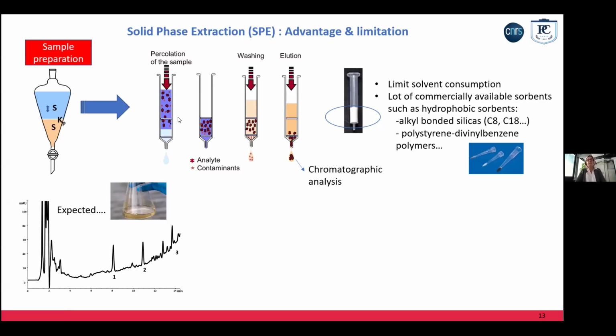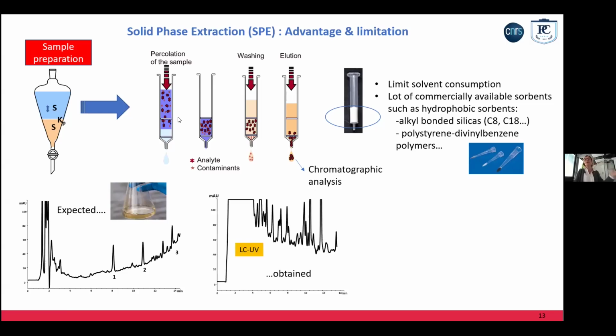The problem is, if I apply this method to quite complex samples, we can expect such a nice chromatogram, but in reality, this is this type of chromatogram that we can expect.